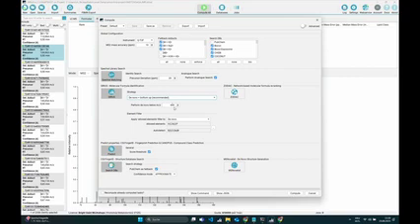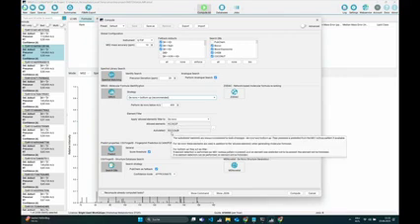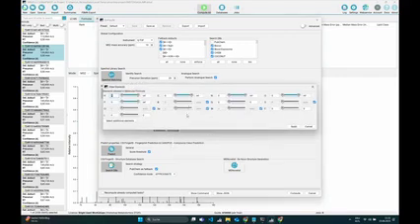One setting which can also be important for you is the allowed elements list. Especially if you only do the de novo strategy, you might want to set some elements. Here are the allowed elements in this list, and there are also some elements which can be auto-detected. I would just leave this at auto-detection, but there are some elements where auto-detection is not possible yet. For example, you know that you have some fluorine in your data, or you expect some fluorine.